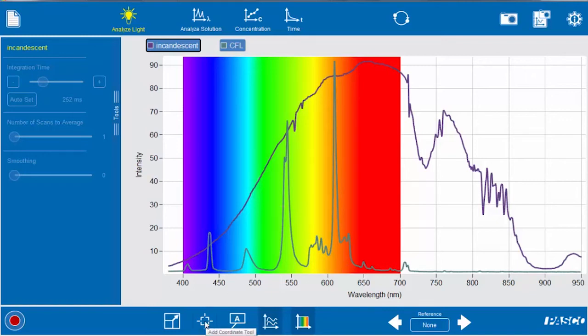This button down here allows us to add coordinates, so we can add that coordinate and it lets us see exactly what the wavelength and the intensity is of our peak. So you can see this peak has an intensity of 66.11 at a wavelength of 544.02 nanometers, and you can nudge that back and forth so that you can find the maximum part of the peak.